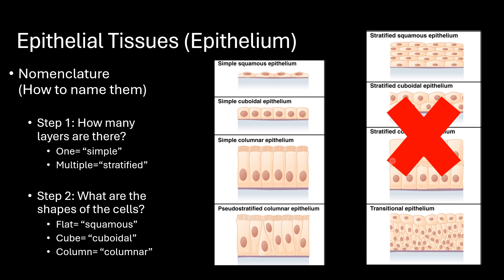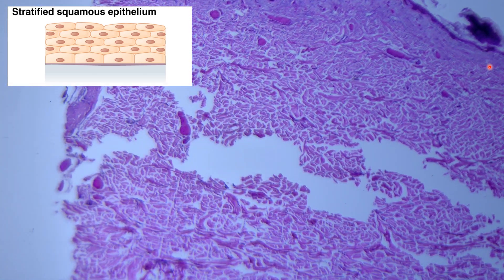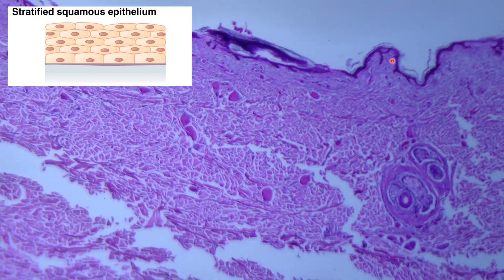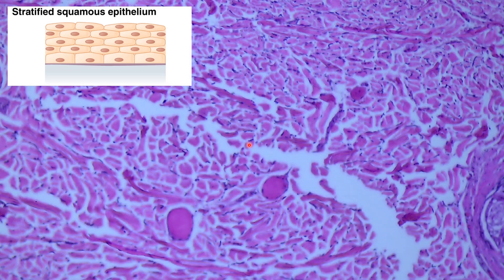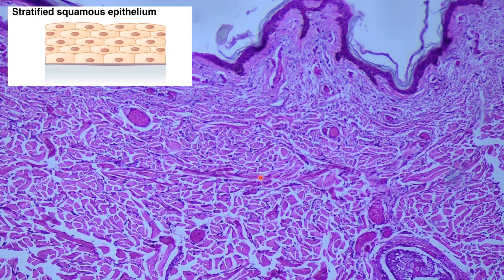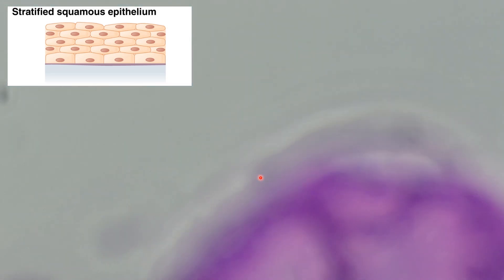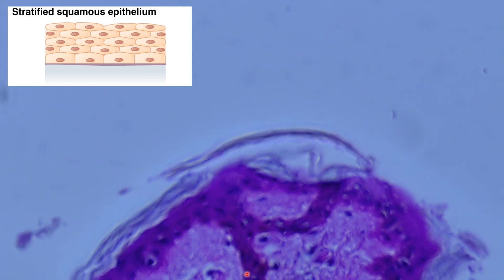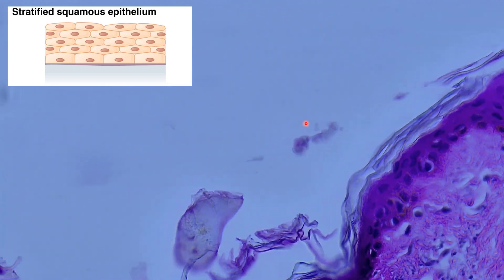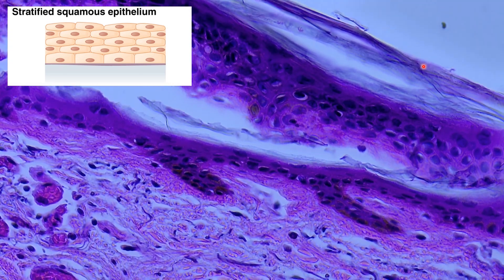Let's start by identifying stratified squamous epithelium. This is a slide of human skin. When looking at these samples through a microscope, it's helpful to orient yourself to what you're looking at. Here at 40 power, the epithelium — the epidermis — is the darker part at the very top. The underlying skin is the dermis, which contains a lot of connective tissues. Zooming to 100 power, we can see some glands, some vasculature, and mostly dense irregular connective tissue containing a variety of different cells and extracellular matrix products.